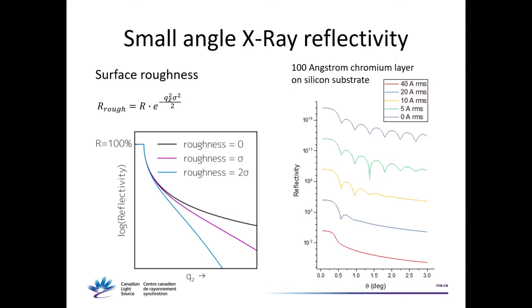You can also get roughness from reflectivity. Roughness is going to kill your reflectivity signal — the higher the roughness, the faster the reflectivity signal falls. This is an example for a 100 ångström chromium layer where increasing the roughness destroys your measurement.